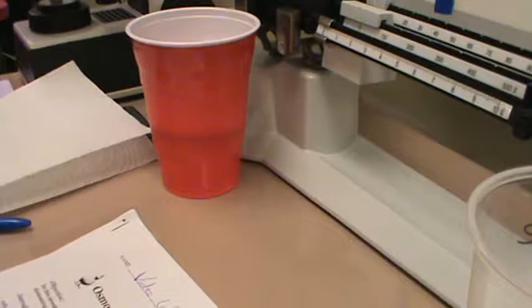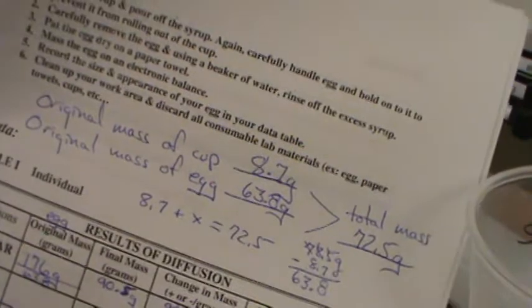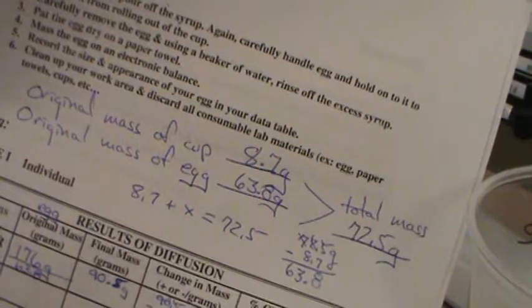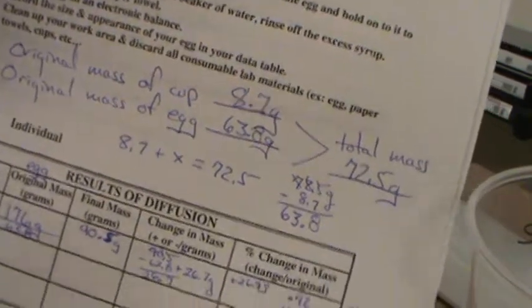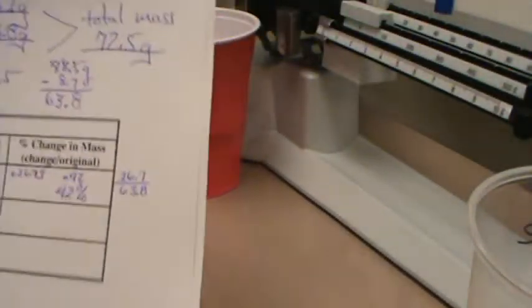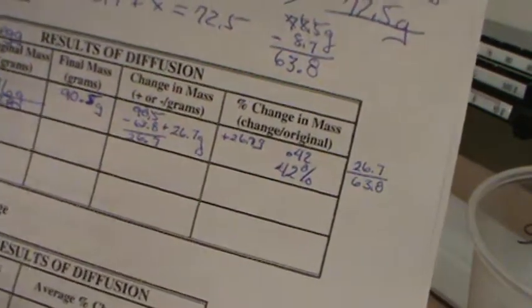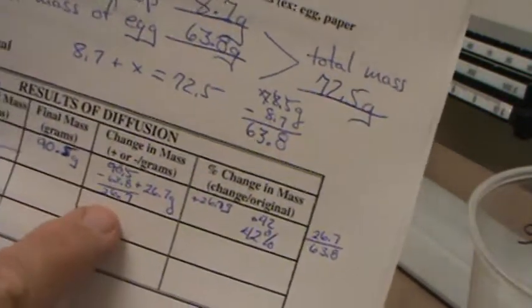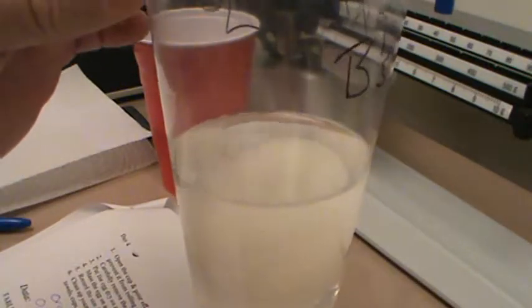And so on our original lab number 1, we got the original mass of the cup, the original mass of the egg and the cup together, and then we determined that our egg started out at 63.8 grams. And then come to find out yesterday, after it had sat 24 hours in vinegar, that our mass had increased to 90.5 grams, which meant we had a net increase of 26.7 grams. So then what we did with our egg was we put it in distilled water.